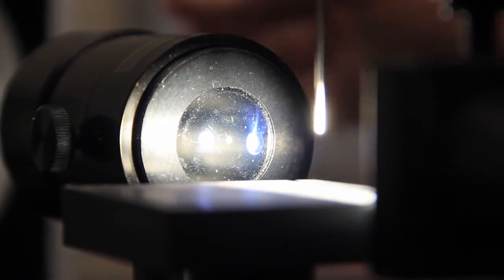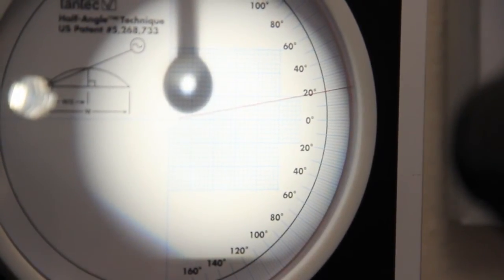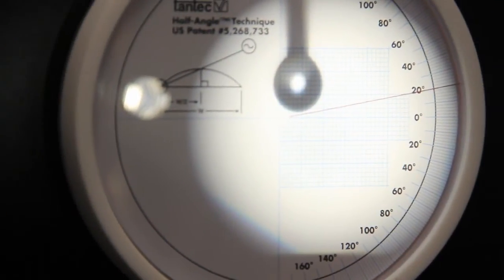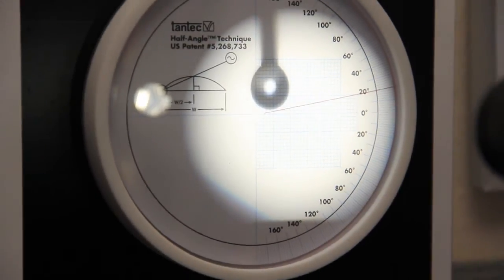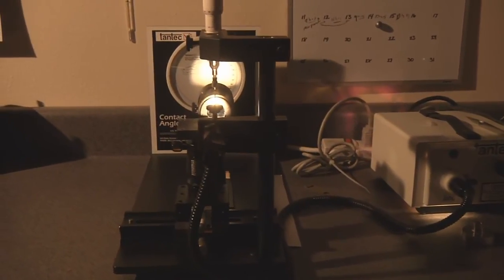We take a contact angle of that material by adding a small droplet of water, measuring that contact angle before the plasma, and then measuring it again after the plasma.